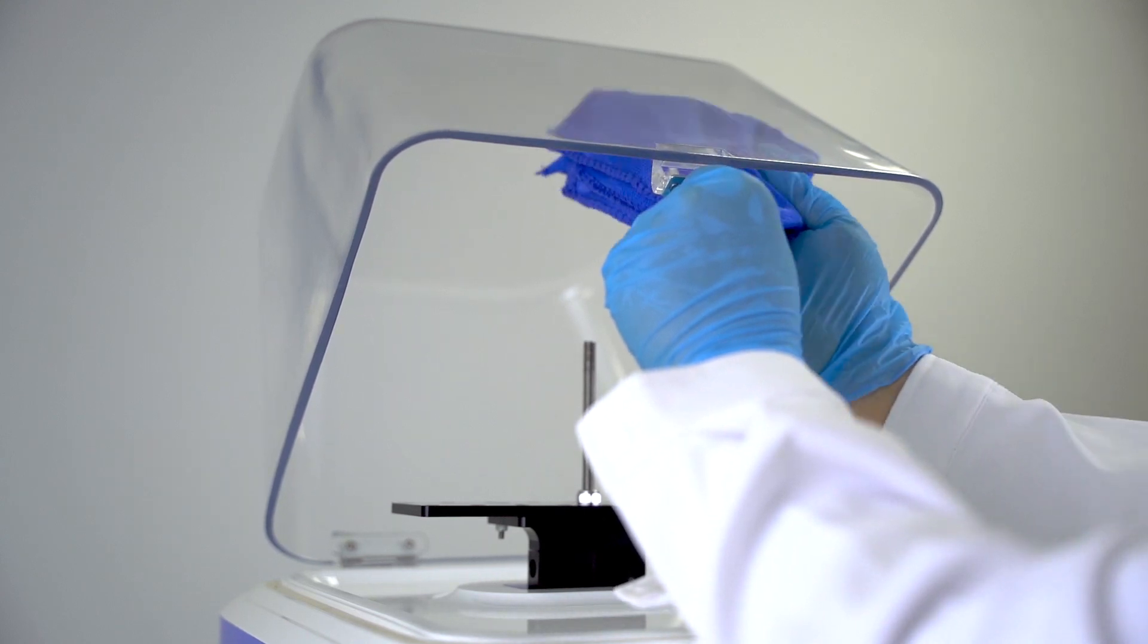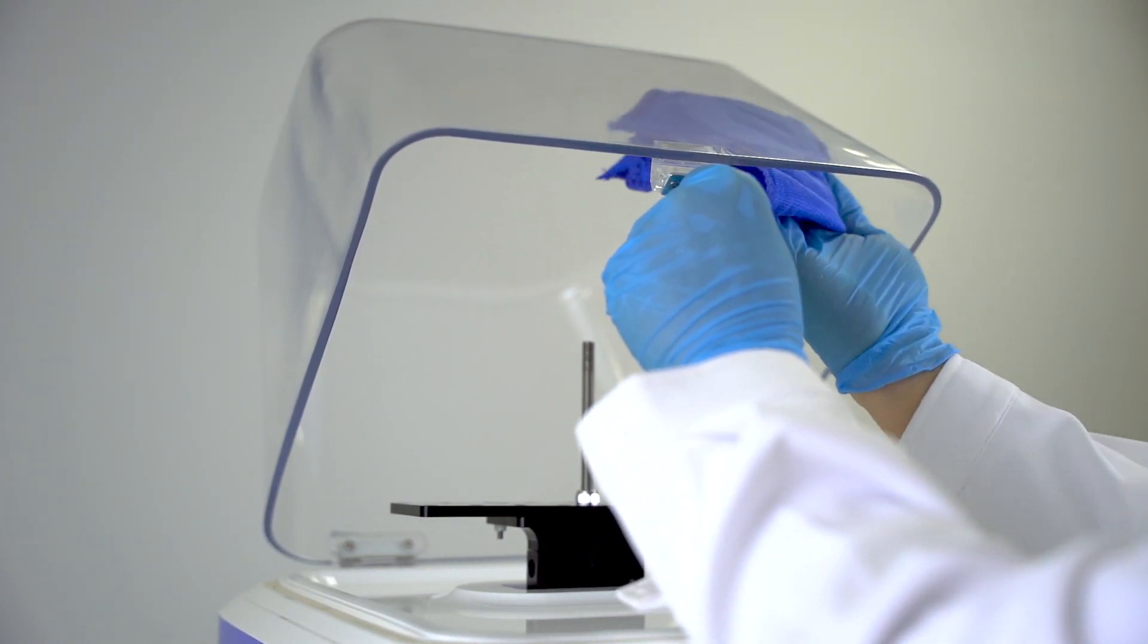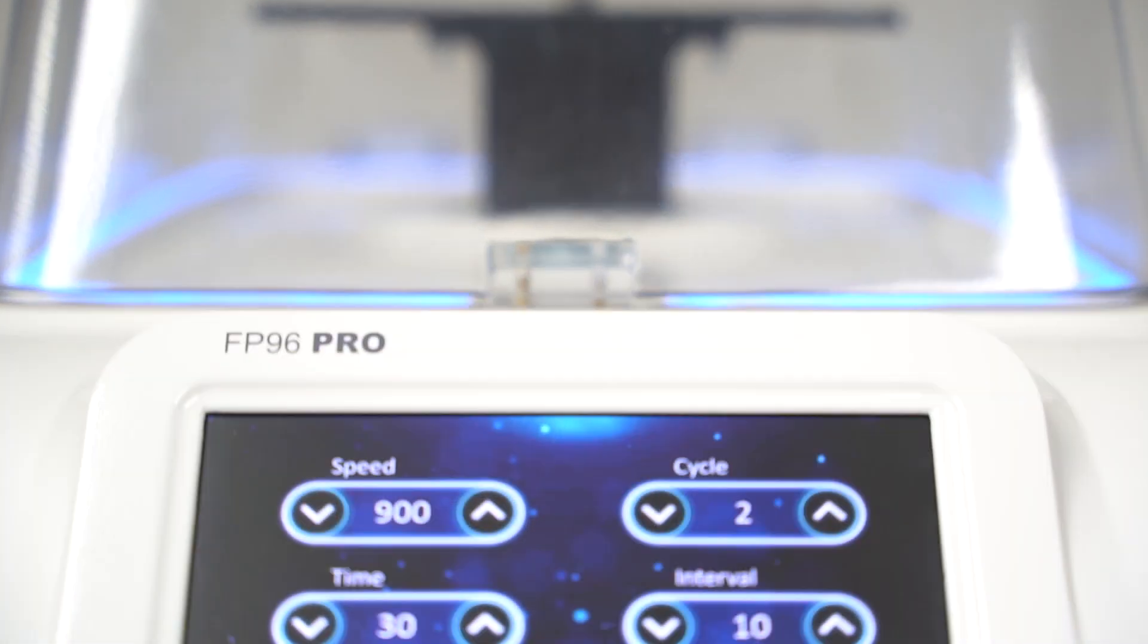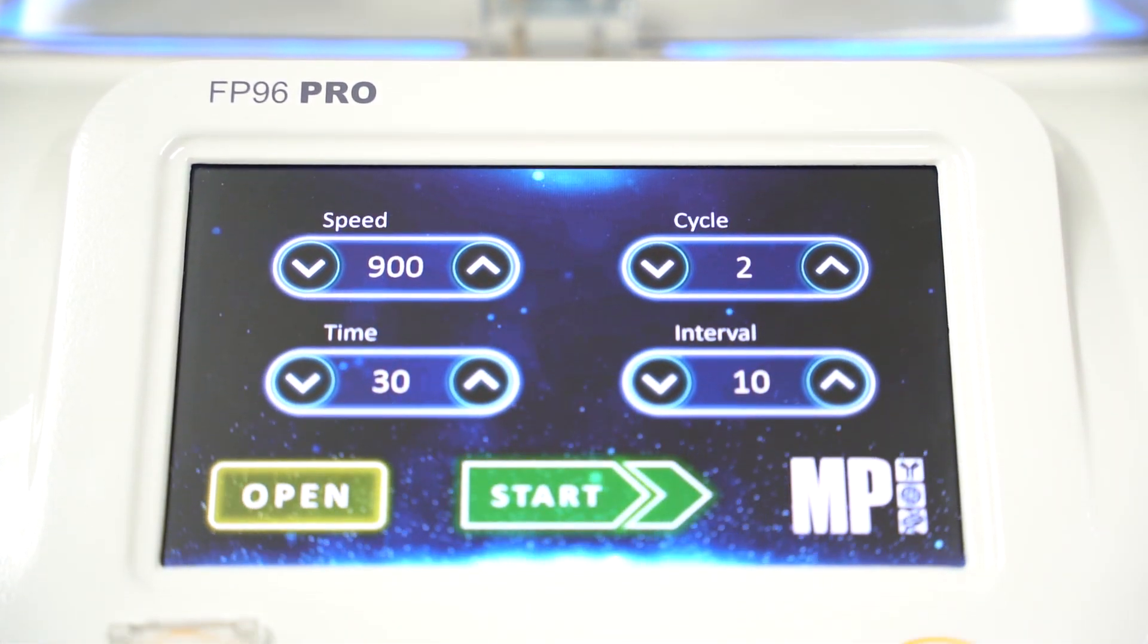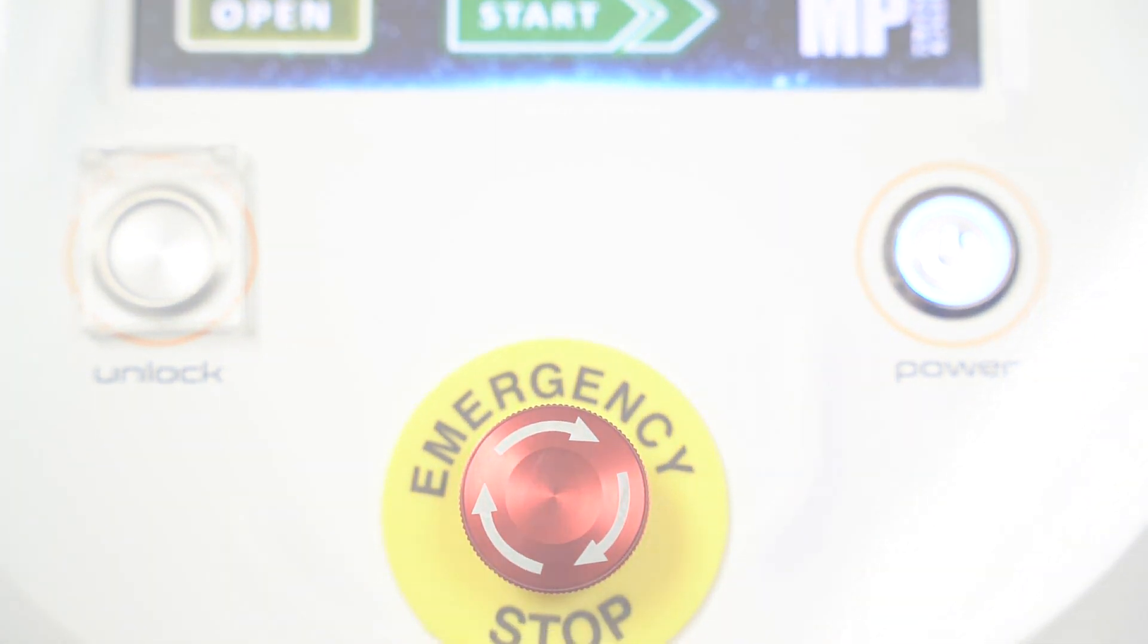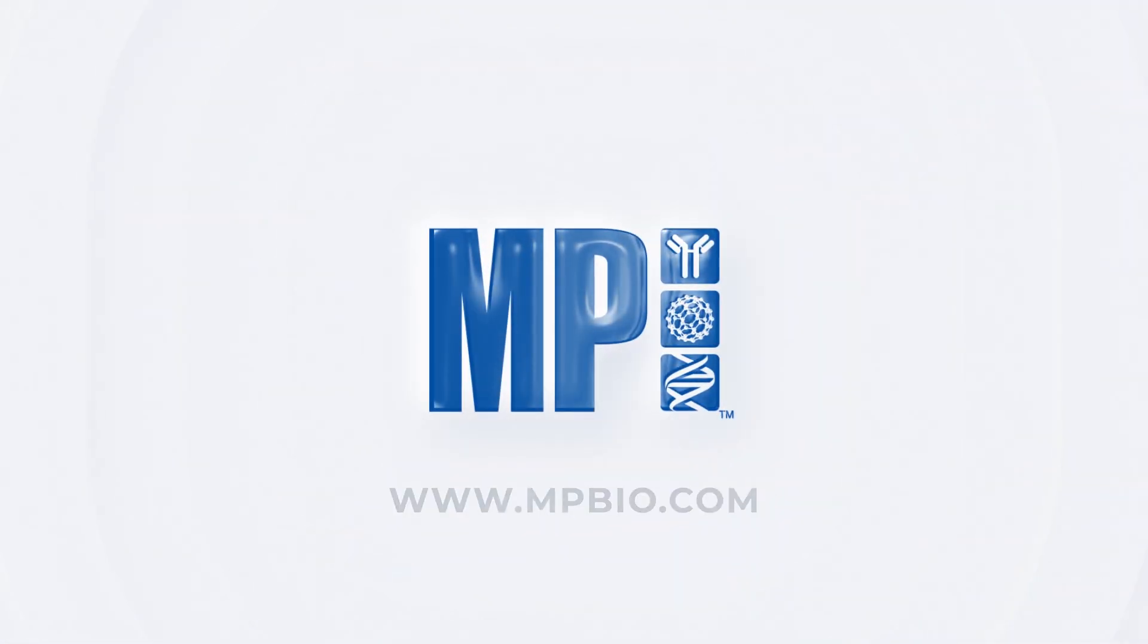Make sure to dry the FastPrep 96 PRO thoroughly before using it again. Thank you for choosing FastPrep 96 PRO, the future of high-throughput homogenization. For more information, contact us at www.mpbio.com.